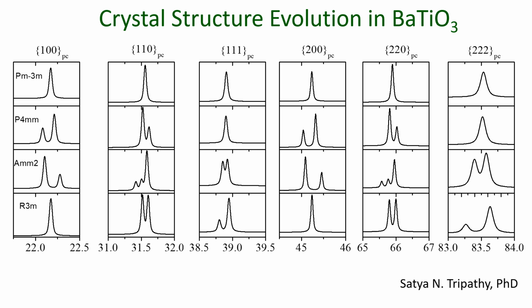M means cubic. You can see I have represented this XRD data in various pseudocubic indexing. The most important thing in pseudocubic is that what you will see in 100, the same thing will appear in 200. What you will see in 110 will appear in 220, but the XRD peaks will be broader. So whether you represent 100, 110, 111, the same thing will appear in 200, 220 and 222. That is the most important thing for us.